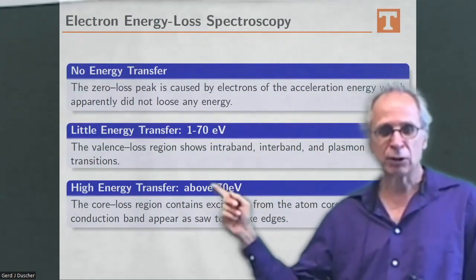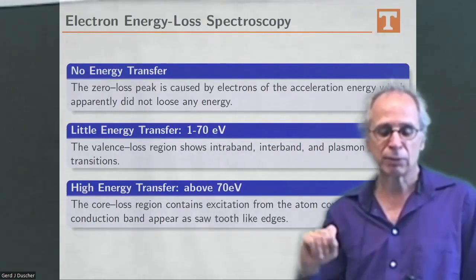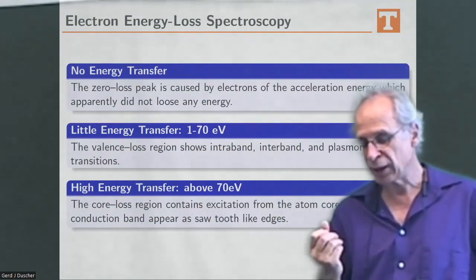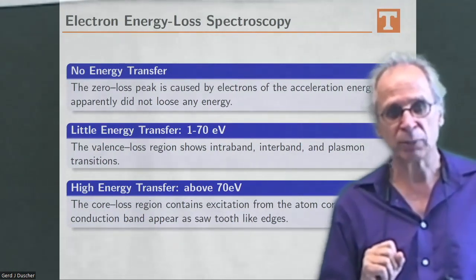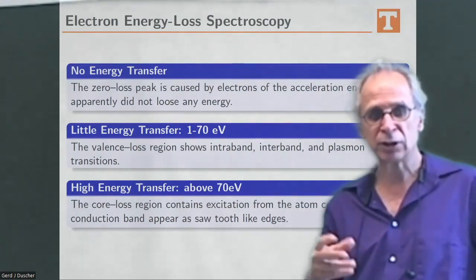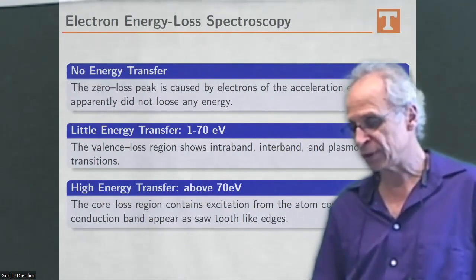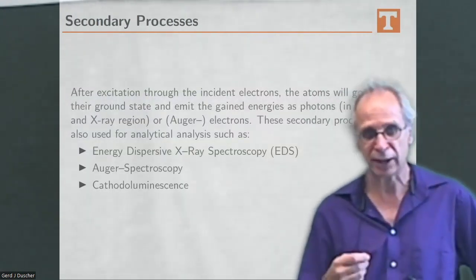And so the advantage of that is this is more delocalized from the primary interaction point of view, while this one is really on an atomic level. And so you can get your chemical composition and your bonding very, very localized. So it depends now on the physics of the interaction, no longer on where the interaction happens.